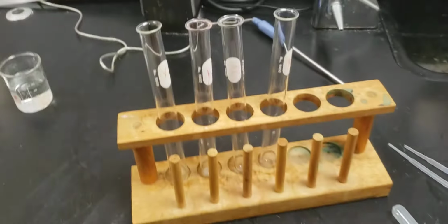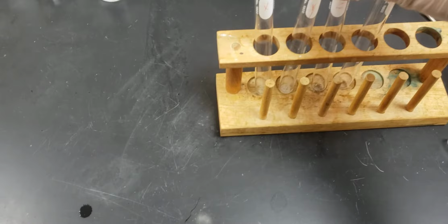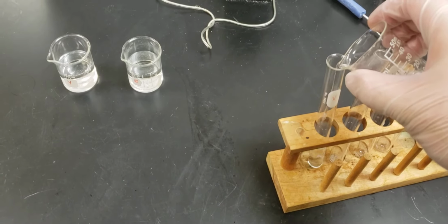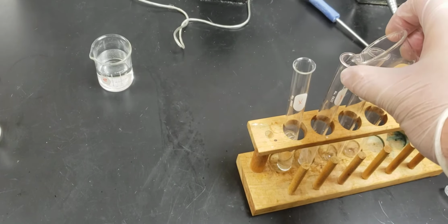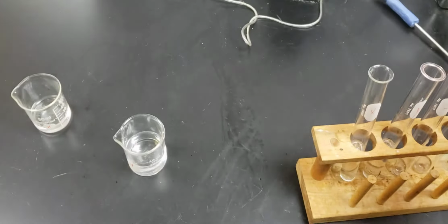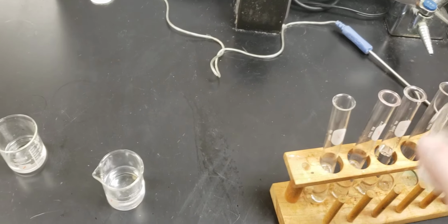This is a qualitative lab. So for the qualitative lab, we're going to put a little bit of each one into the corresponding test tube. We're going to take note of how each one looks before we add anything to it.